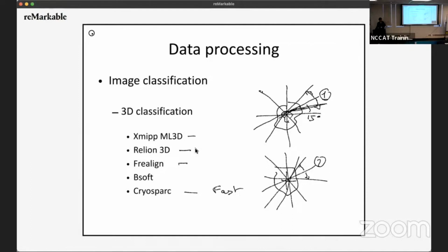The second very important aspect, and I think I'll stop there, is at what resolution do you do your classification? Depending on what resolution you use, the kind of features you will classify will be very different. So in RELION, for example, if I started at 100 angstrom and funneled down without any restriction, I would basically funnel down to one super sharp ribosome and everything else being garbage.